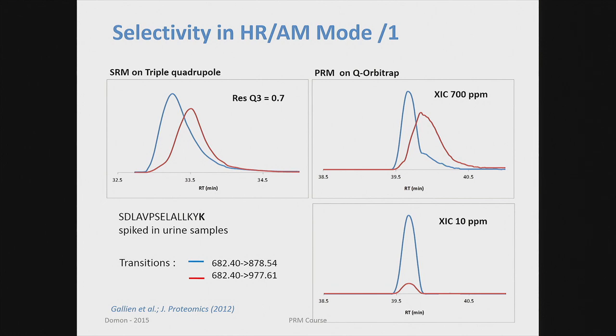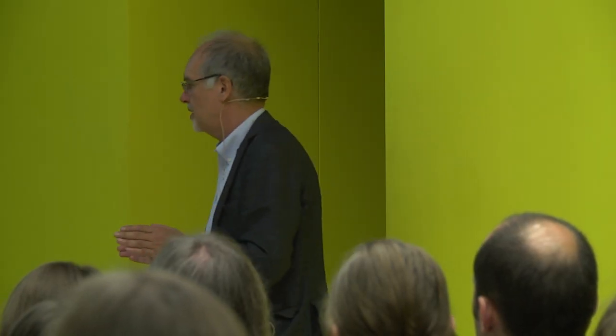We're measuring typically with very good mass accuracy, 5 ppm or less, and that's a point I haven't discussed yet: not only do we measure in high resolution, but we measure in accurate mass. That means the precursor ions and the fragment ions we have at millimass level precision. So we can use that information to make sure we're actually measuring the right peptide and not something else.